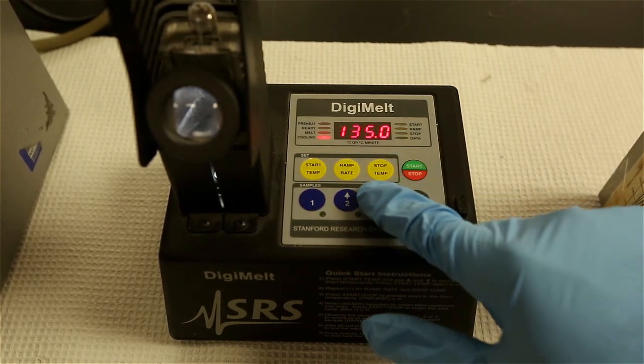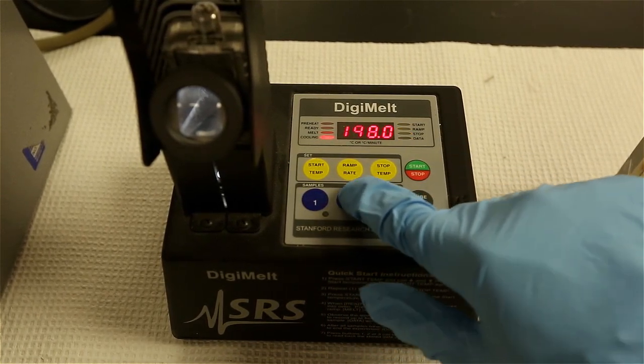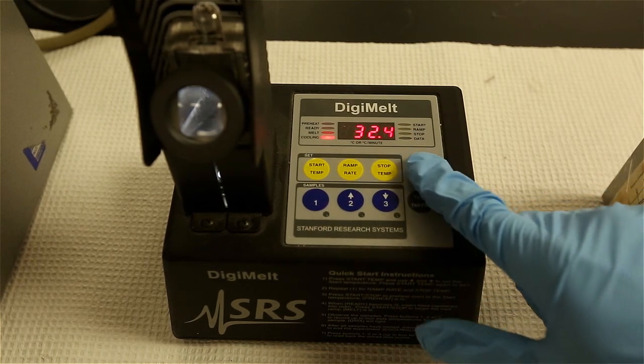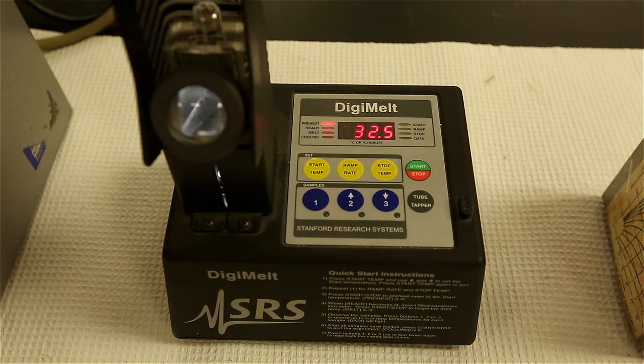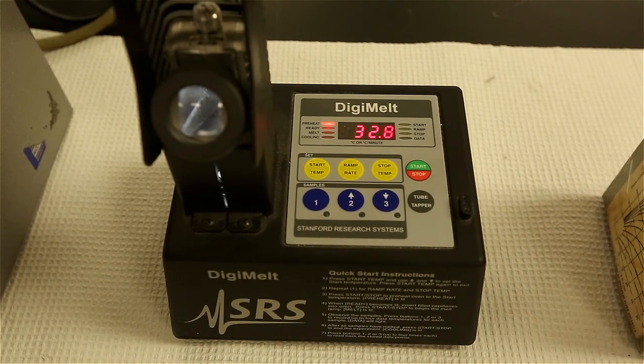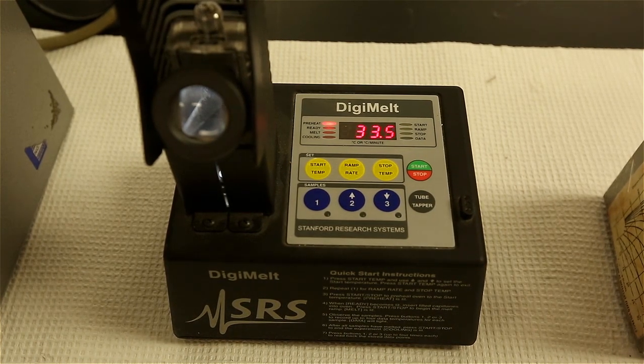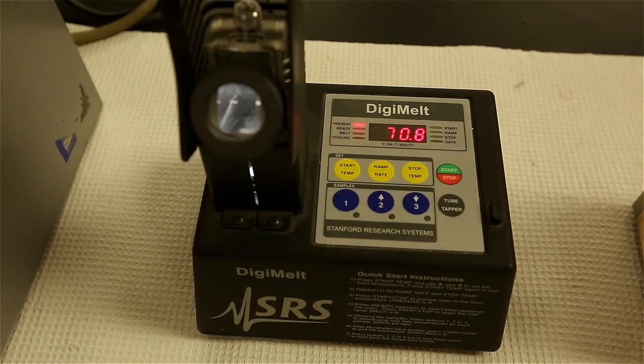An alternative way of measuring melting point is to test your sample quickly once with a high heating rate to determine approximately what the range is, and then do it a second time with starting melting point within 20 degrees of the range that you got from the initial rapid heating. This method is efficient for high melting solids.